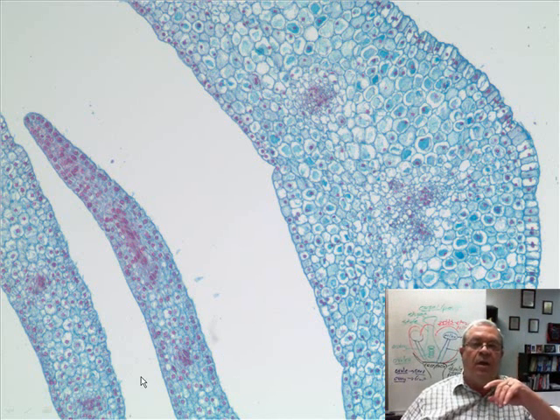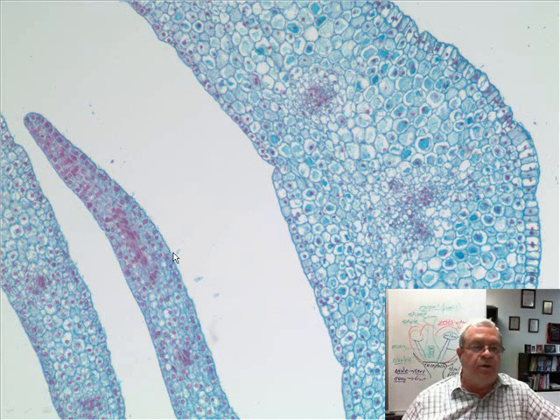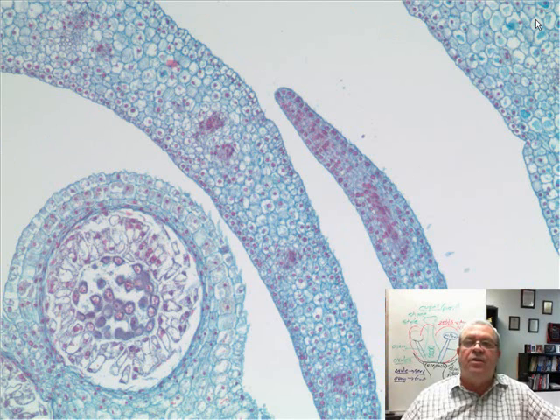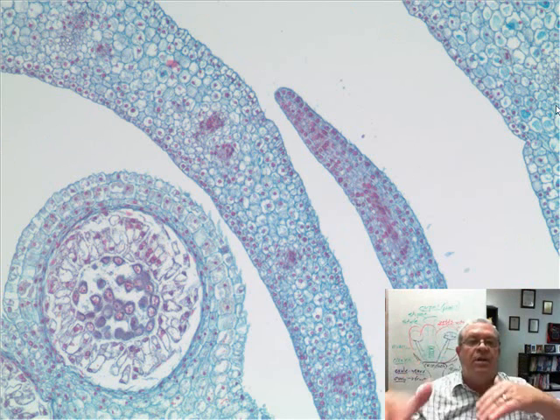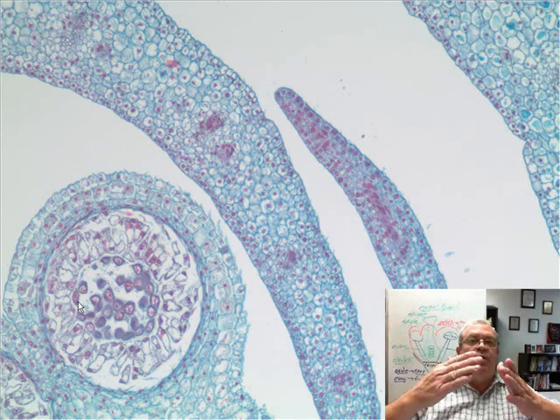And so, what's the next thing in? These must be baby whats. Inside the sepals are the what? The petals. Yes, these are baby petals. The flower is still all folded up. These are baby petals. Let's move in a little bit farther. Over here to the upper right, we still have our sepal. Now we've got a couple of overlapping baby petals. And so, sepals, petals.